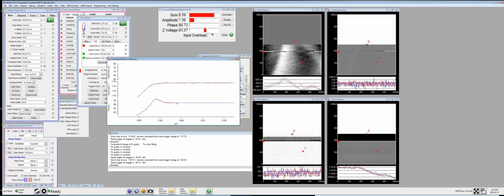So what happens is that we don't see any discrete transition anymore, but the phase goes above 90 degrees and then below 90 degrees smoothly. This is the smooth transition, and this is the transition at which force versus distance curves show us that we can access all the distances and all positions. So the system has enough kinetic energy that it will not be trapped onto the surface.